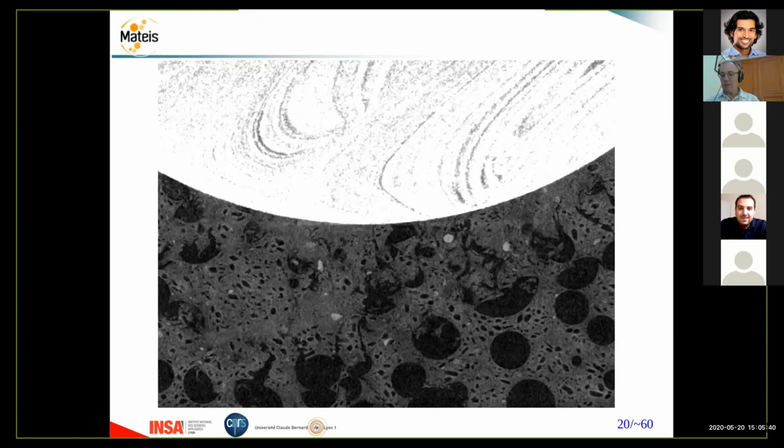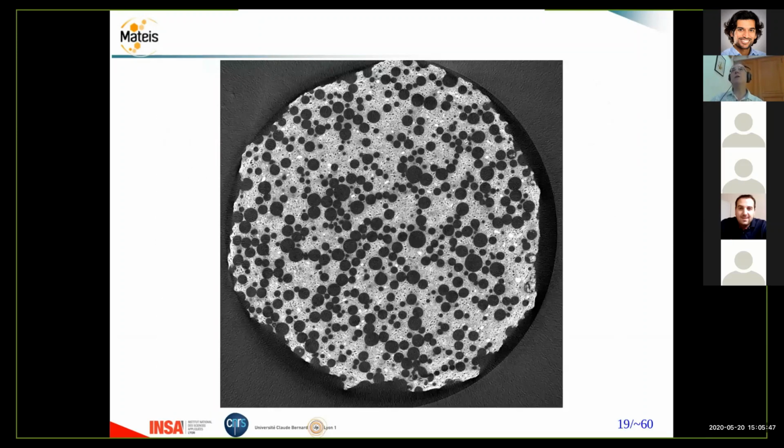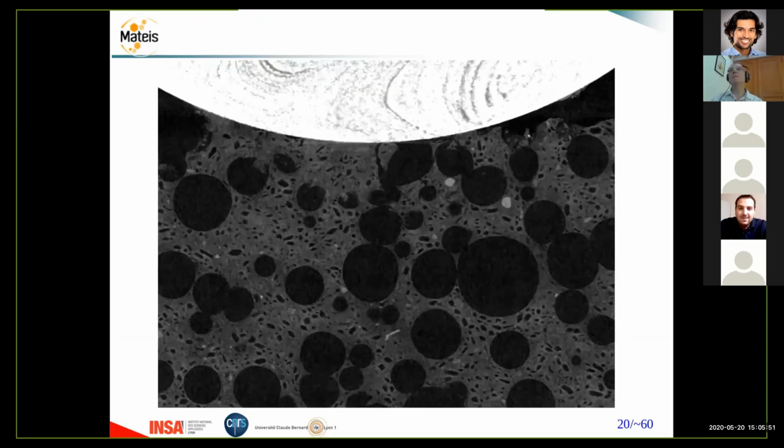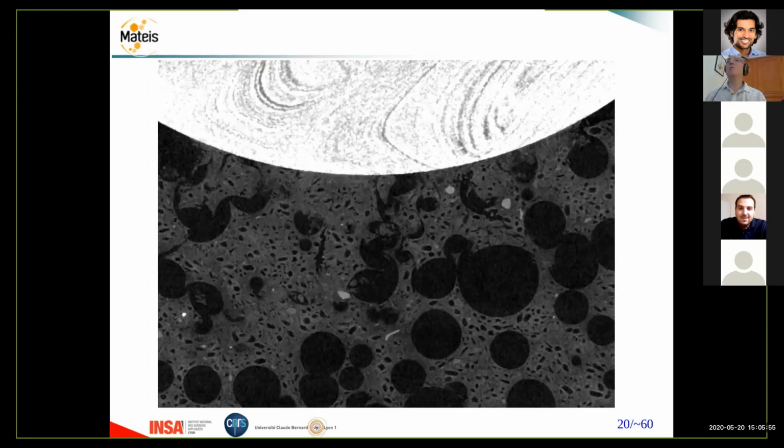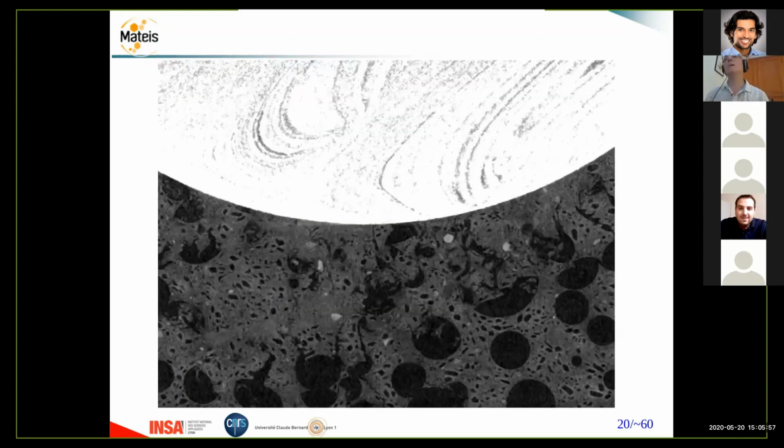And the step that you see here, what is the best step? I would say the best step is the longest step that allows you to perform the correlation. Maybe not the best step, but the number of steps, the discretization of the entire test.